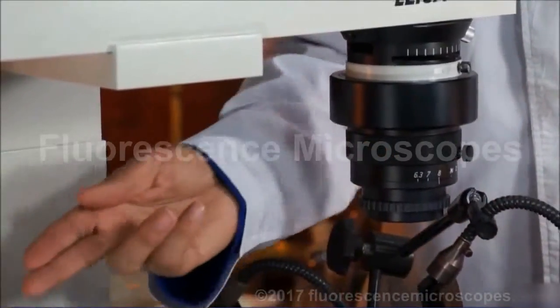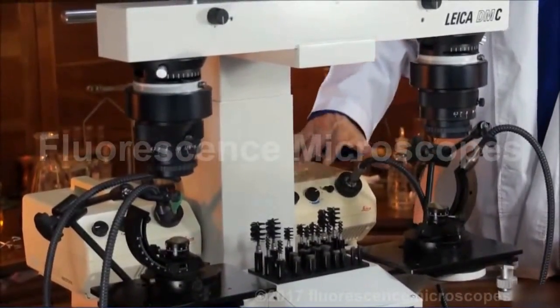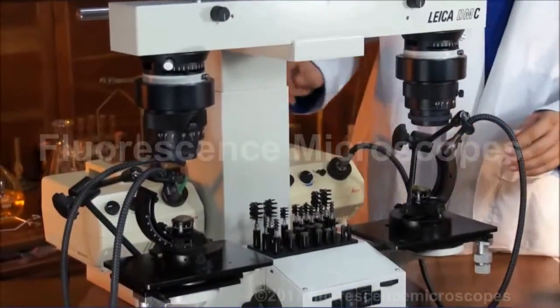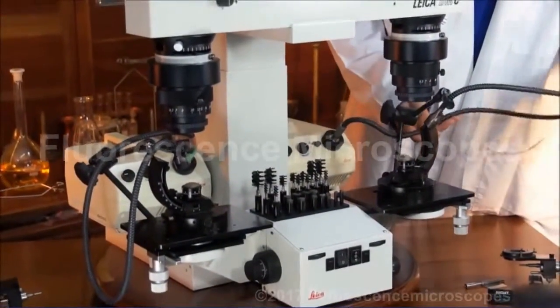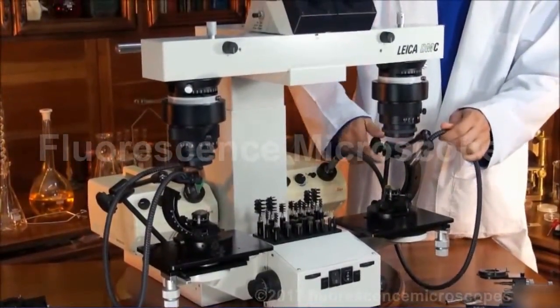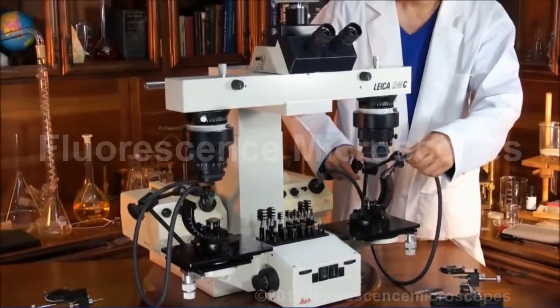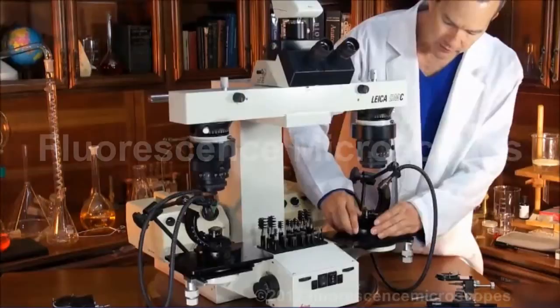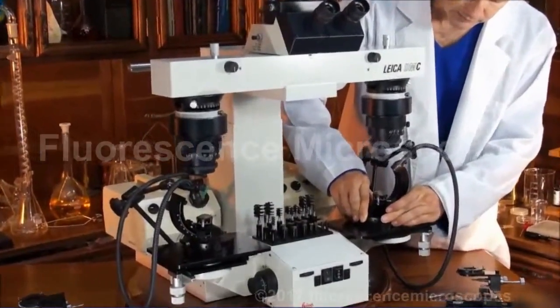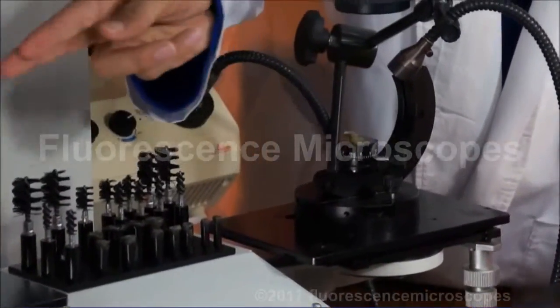We've got bullet holders, one on each side. We've got the fiber optic illuminators in the back, 150 watt, with fiber optic cords that can be adjusted — you can rotate them. The bullet holders themselves can also rotate. We've got the gum on there for the bullets.